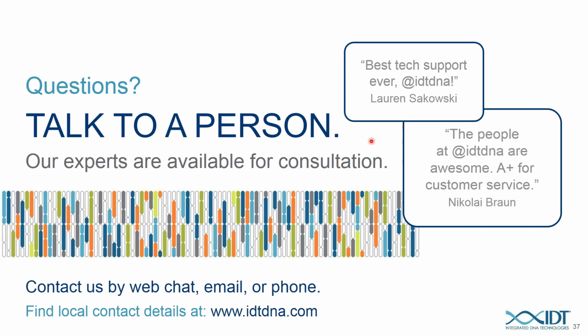Okay, so here's a question, and this is a great question just in the context of all of this, talking about design algorithms and the need for a Hi-Fi Cas9. It used to be that there was a very clear idea of the importance of the position of those variation bases. If there's a variation that's far away from the PAM site, it doesn't have as much of an effect as if it's close. But is that difference also hard to predict now?